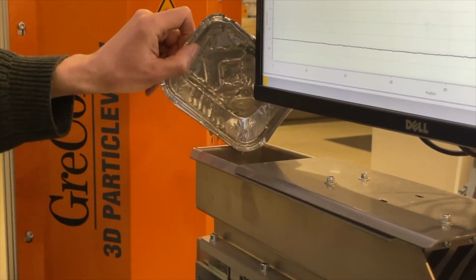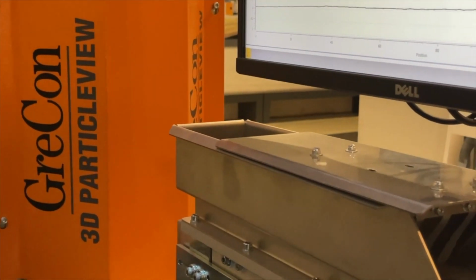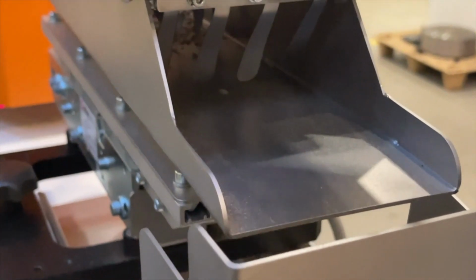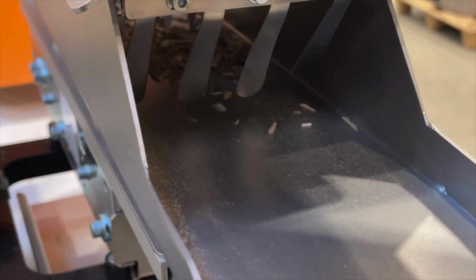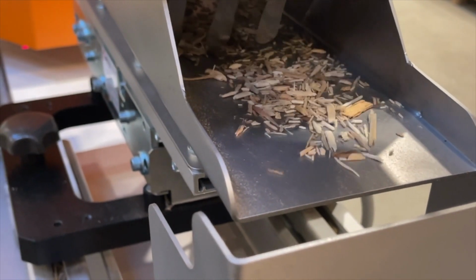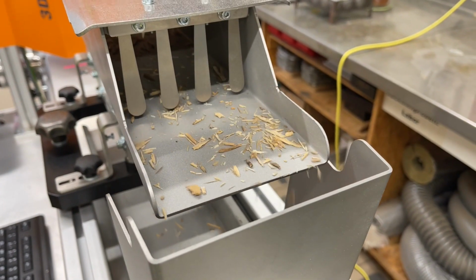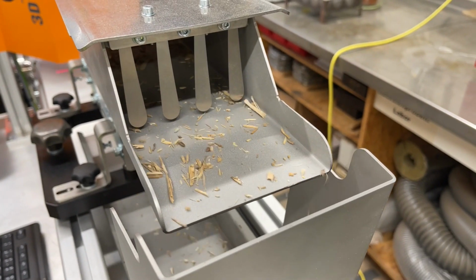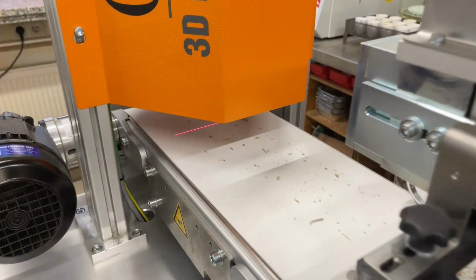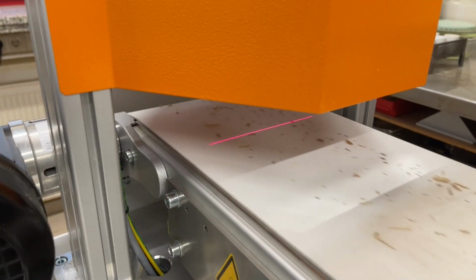How does the 3D particle view work? The procedure is very simple for the operator. All that needs to be done is to put a particle sample of about 6 to 8 grams into the vibrating chute of the measuring system, although larger particle quantities are possible. The particles are automatically separated and then transported by a conveyor belt through the optical measuring unit that measures all 3 dimensions of the particles fully automatically using a combination of a line laser and camera unit. Depending on the sample quantity, the system needs about 3 minutes to measure a sample.